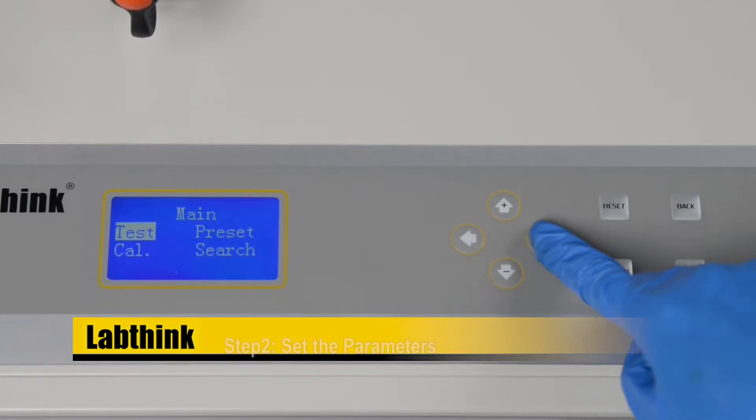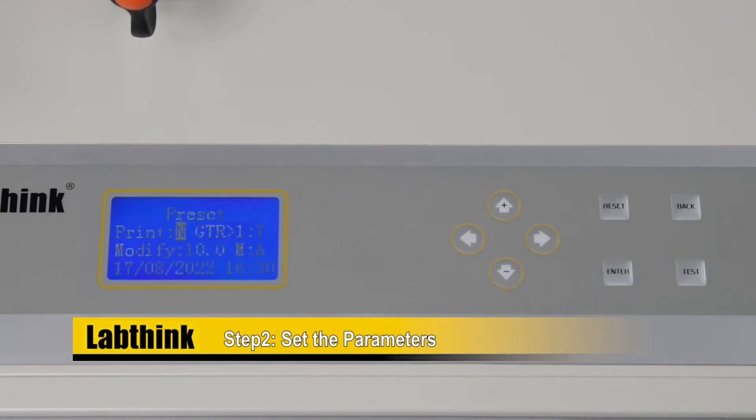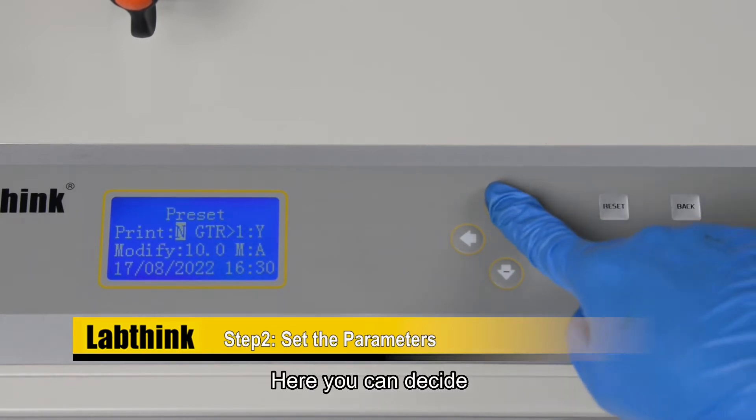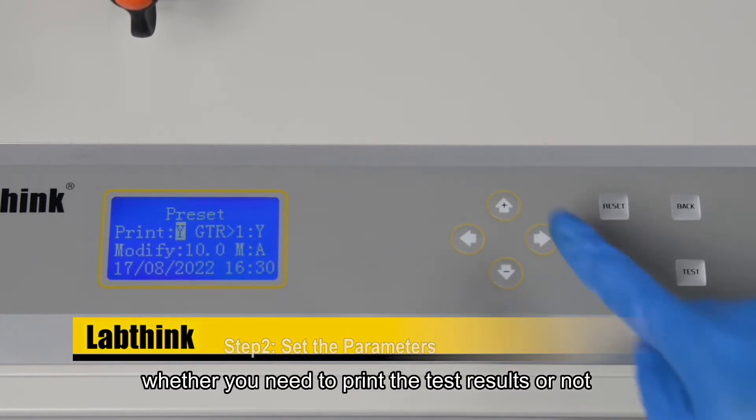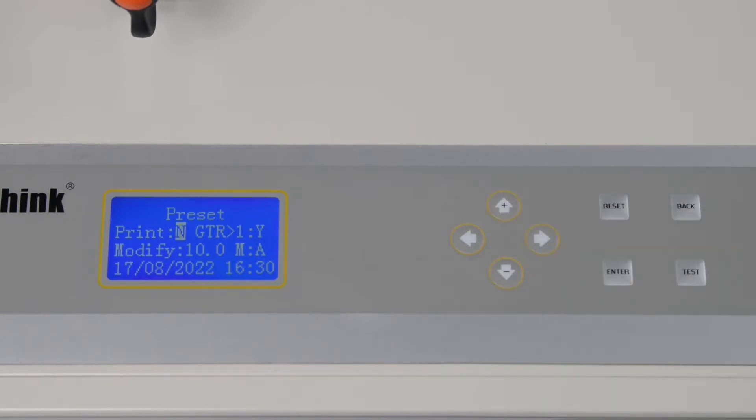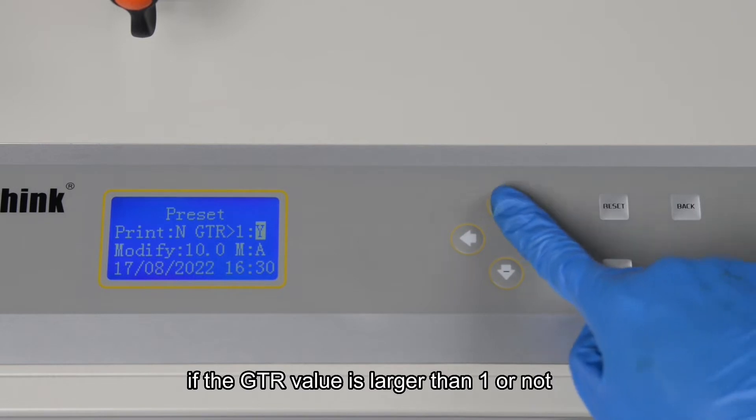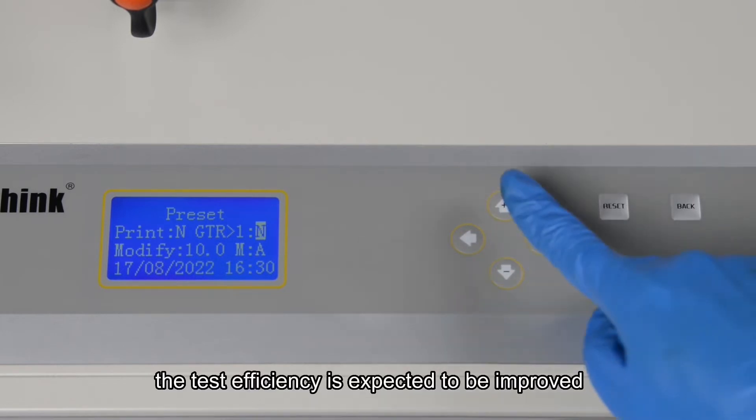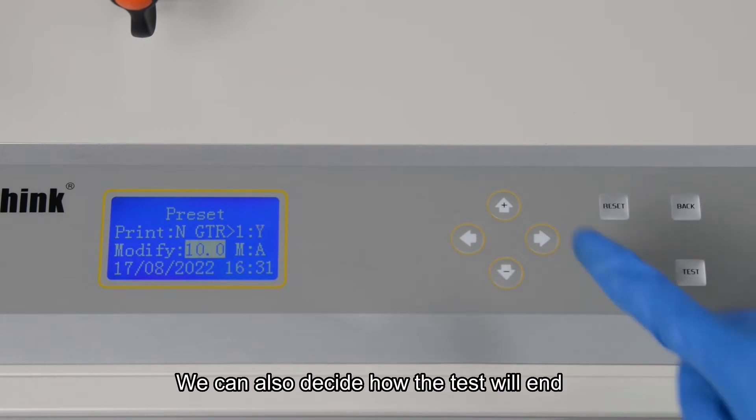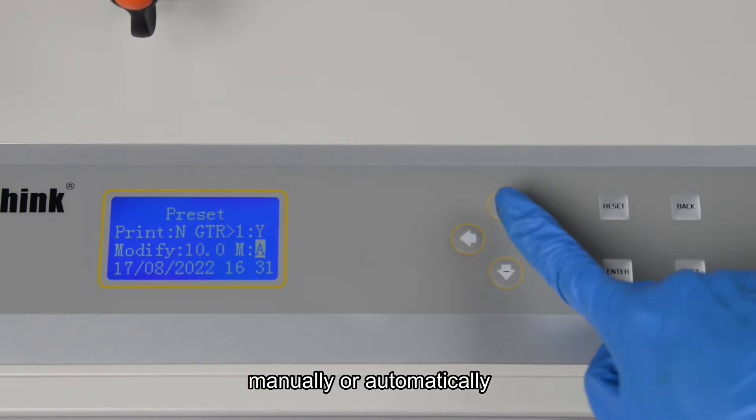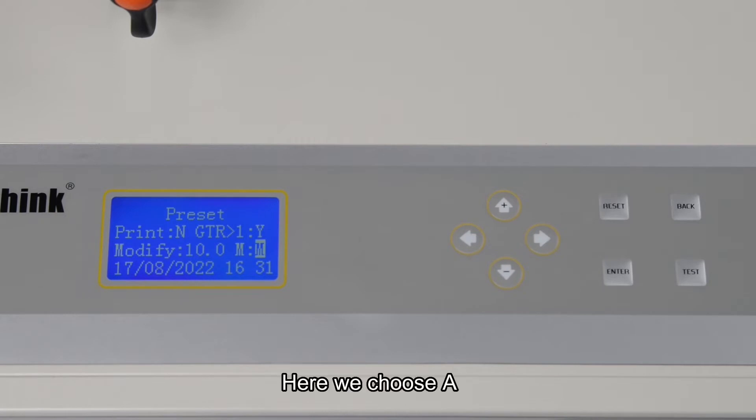Step 2: Set the parameters. Here you can decide whether you need to print the test results or not. By pre-determining if the GTR value is larger than 1 or not, the test efficiency is expected to be improved. We can also decide how the test will end, manually or automatically. Here we choose A, which is automatically.